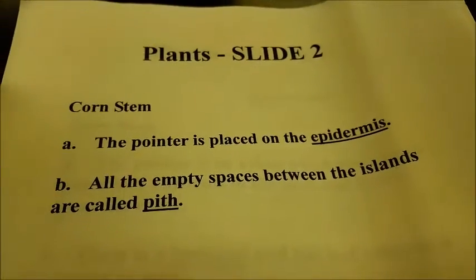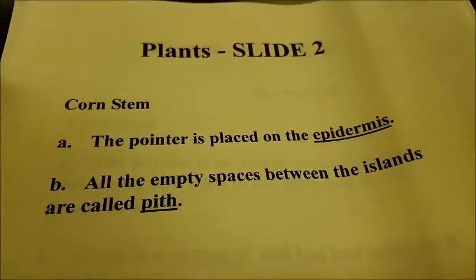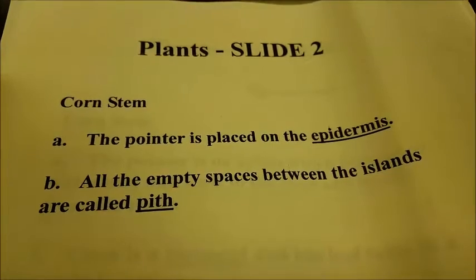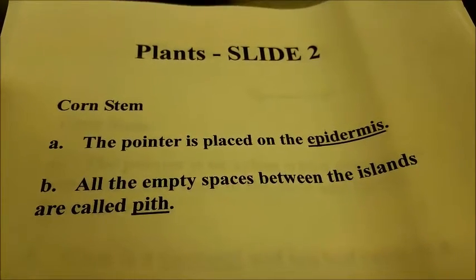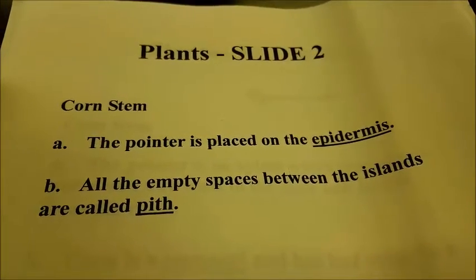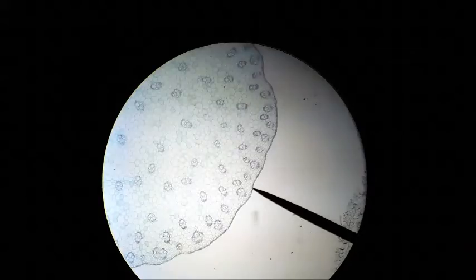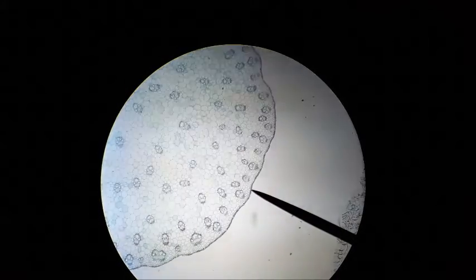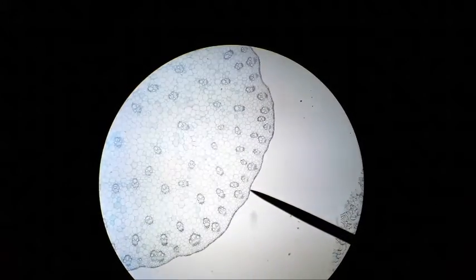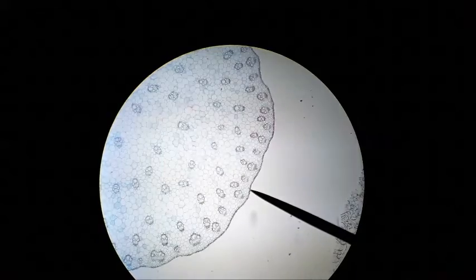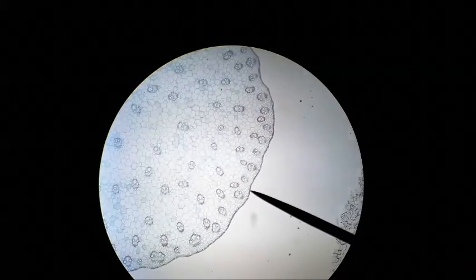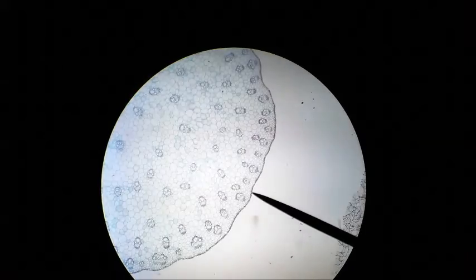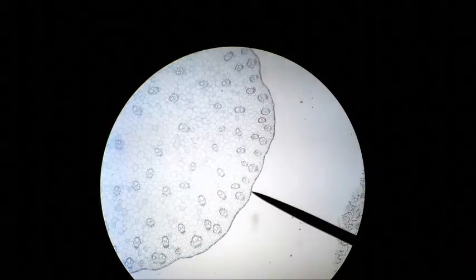In this picture of the corn stem, the pointer is placed on the epidermis. All the empty spaces between the islands are called pith. The little islands inside contain xylem and phloem.